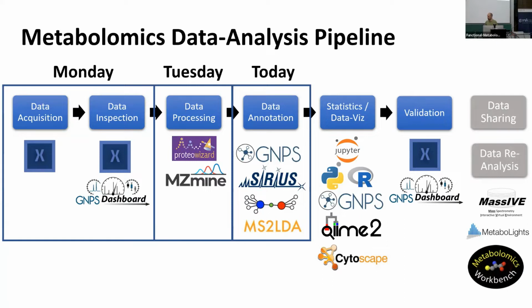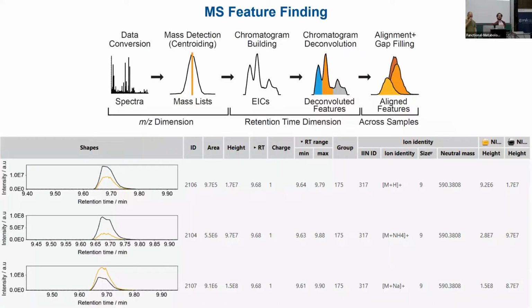Robin is going to showcase quickly now the concept. After submitting the job yesterday evening, what actually happened under the hood in GNPS to get you to where you are right now. Okay, so great to see you again.